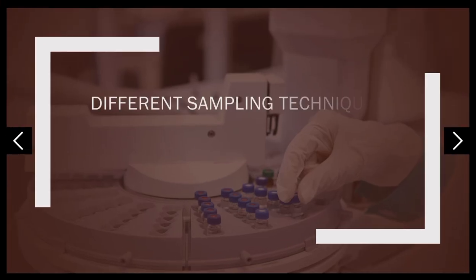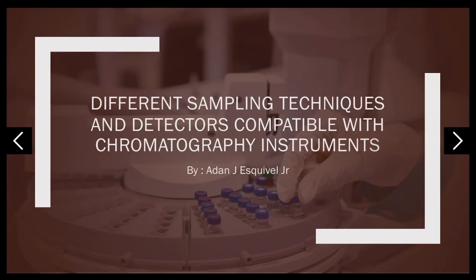Hello, today we'll be reviewing different sampling techniques and detectors compatible with chromatography instruments, by Adan Jose Esquivel Jr.